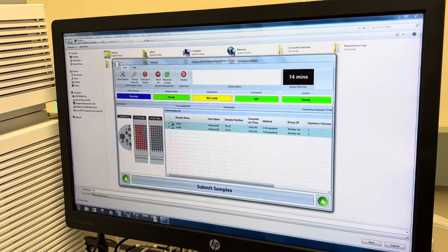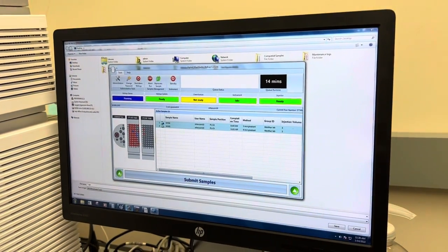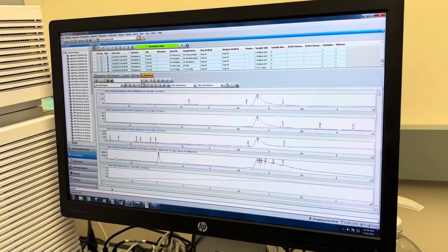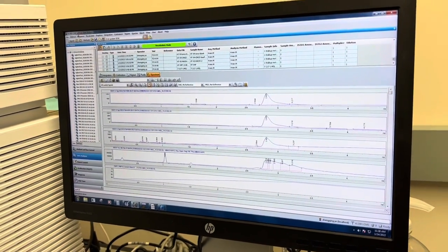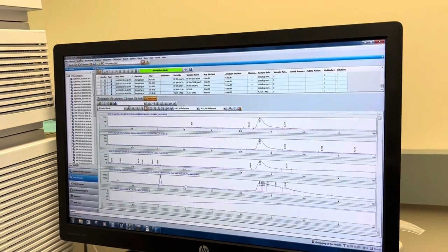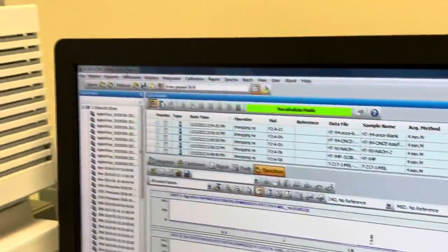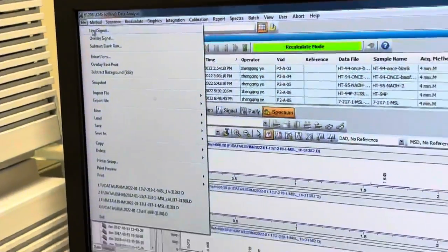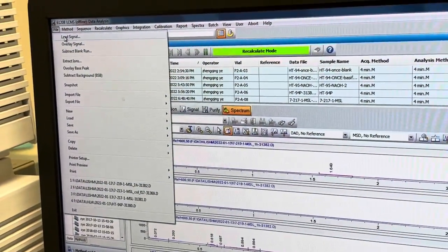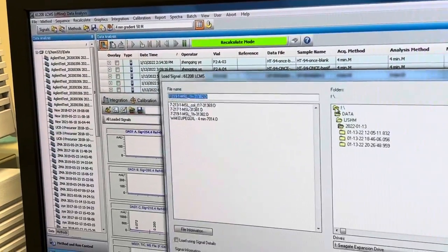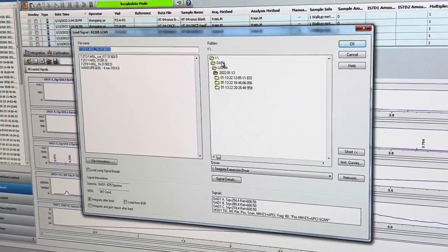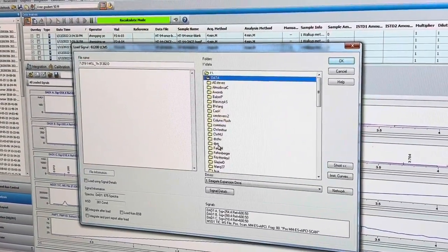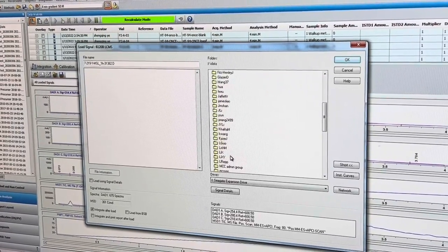Now suppose you want to see the data, okay. So you can find out this LCMS offline data analysis, okay. So go to file, load signal, and go to here like data and find your name like your account name.